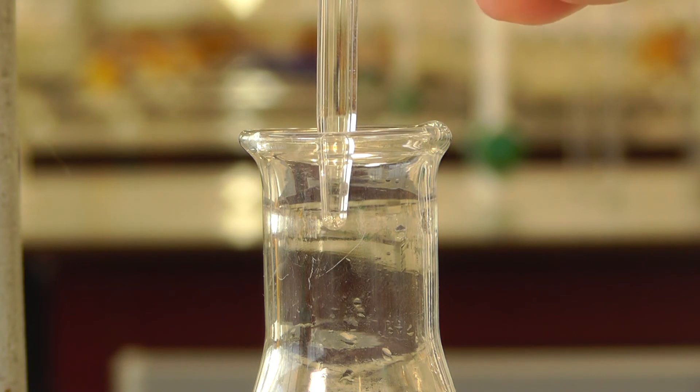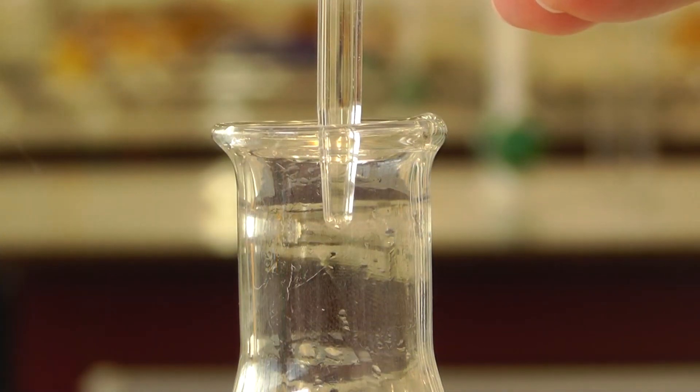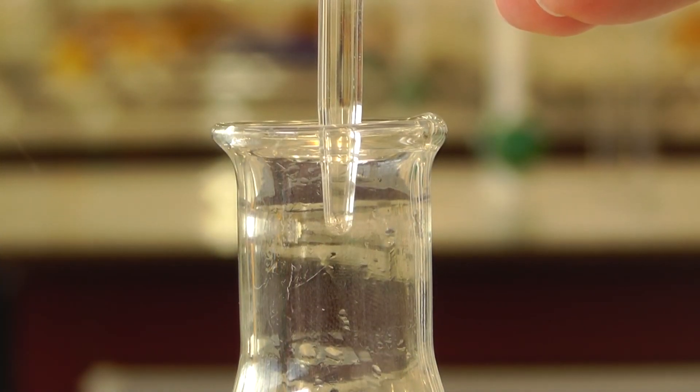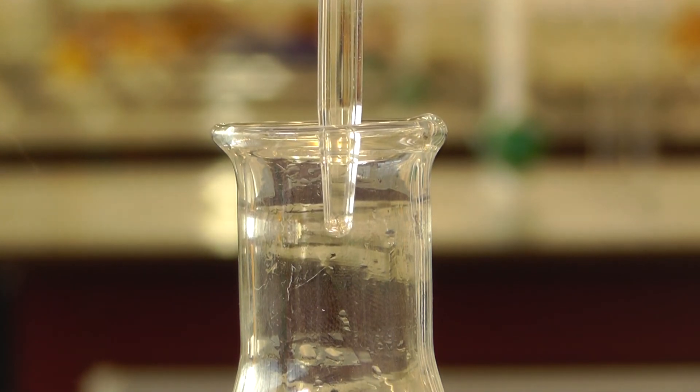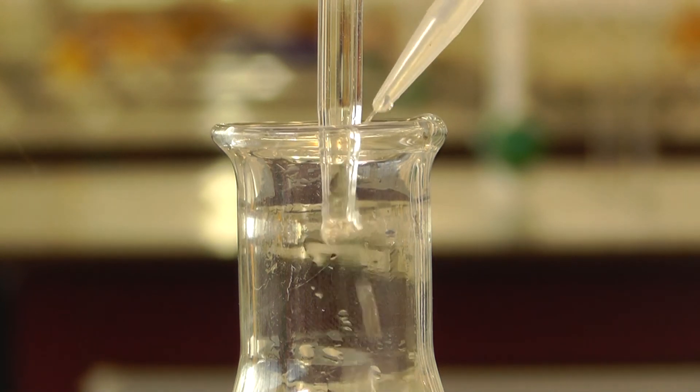Adding solution drop wise is difficult, so be careful when opening the tap. You can also add half drops by closing the tap of the burette while a drop forms on the tip. This half drop should be rinsed into the flask with distilled water.